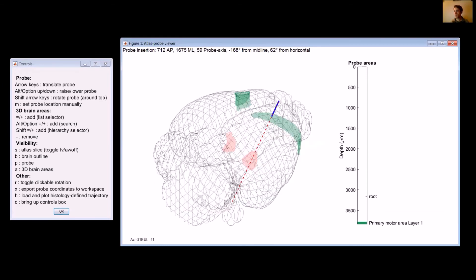This is pretty much the whole thing. There's a little bit of histology stuff that I can show you later when I talk about histology. Other than that, it's meant to mostly just be kind of like a plug and play trajectory explorer. So if anything doesn't work, or you want me to change anything, let me know, and I can, especially in the next couple days, work on it relatively quickly. I'm happy to answer questions if there are any.